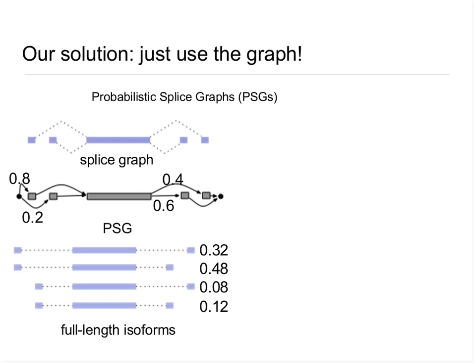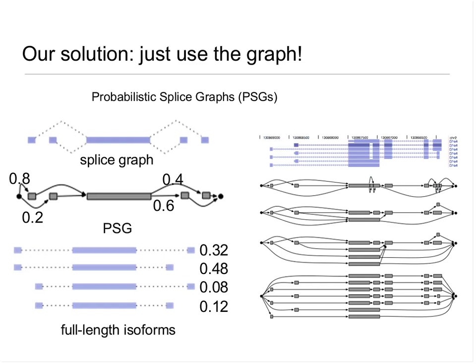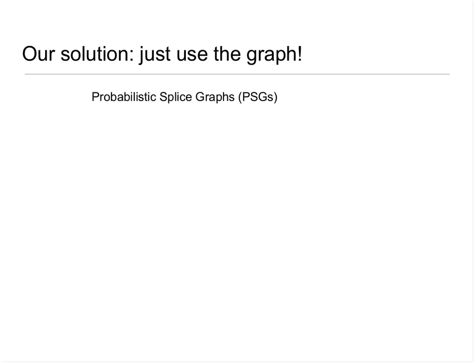So in this example, with just 2 sets of probabilities, if I take the product of these probabilities along each path, I get a relative frequency for that isoform within your sample. Splice graphs can have many different forms that take advantage of different levels of dependencies between different splicing events. It's an open research question how to go from the raw data to the appropriate splice graph that represents the proper dependencies between exons and splicing events.